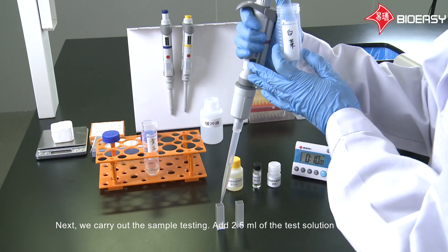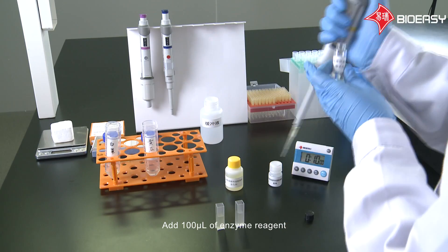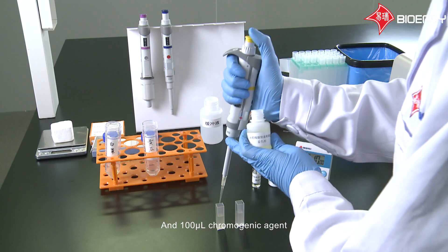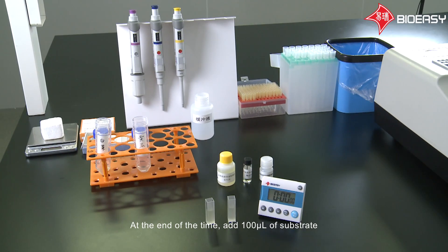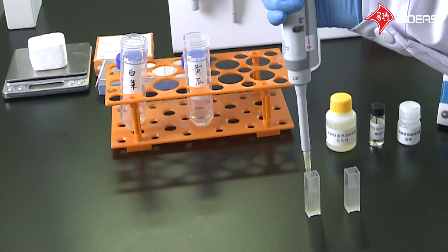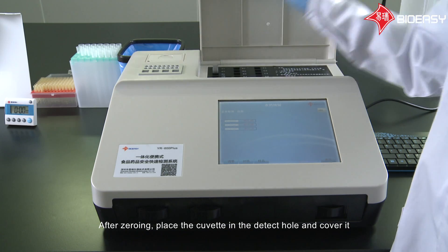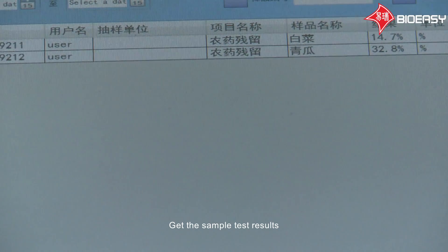Next, we carry out the sample testing. Add 2.5 milliliters of the test solution to the cuvette, add 100 microliters of enzyme reagent and 100 microliters of chromogenic agent, and mix with pipette. Keep in standing position for 10 minutes to complete the reaction. At the end of the time, add 100 microliters of substrate. Mix it quickly and put in the machine for test. After zeroing, place the cuvette in the detection hole and cover it. Press the sample button for the sample test after the absorbance value rises steadily. Get the sample test results.